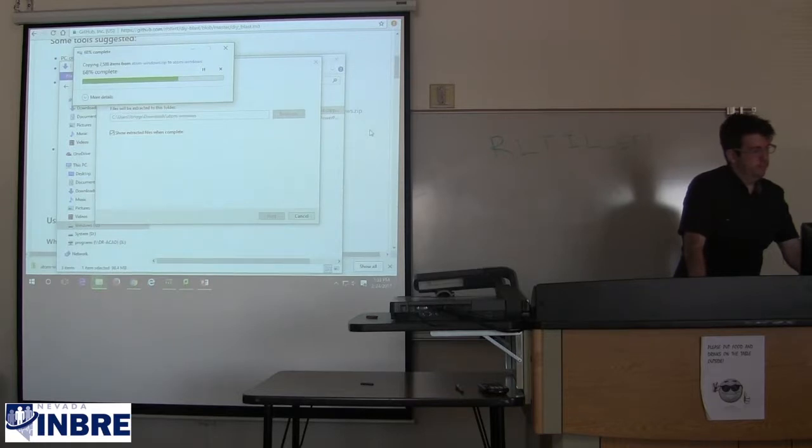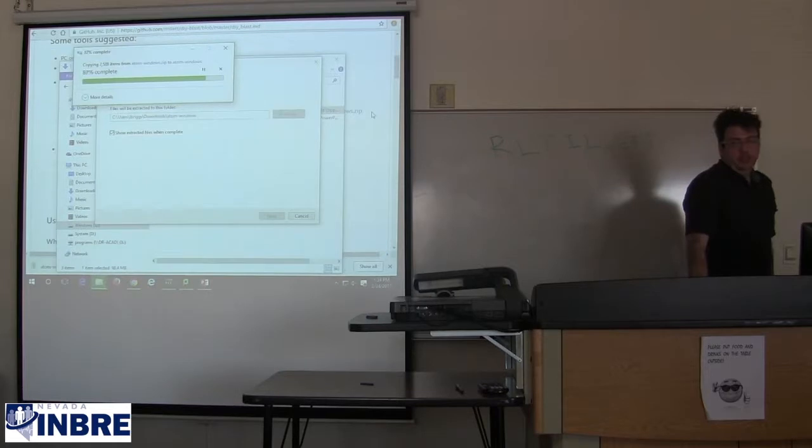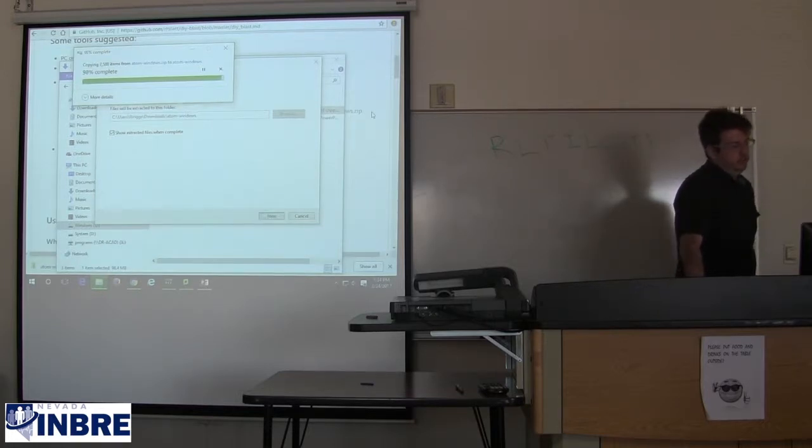And so neither of these are particularly required for doing a bioinformatic task. You could probably get away with using Notepad, but you run into issues career-wise if you rely on Notepad or Word documents for handling your sequences. You want a text editor that sort of does what it says and says what it'll do. And if you're doing cloning things where you might be using restriction enzymes, you're going to want something that allows you to map it out ahead of time, and that's what APE is primarily designed to do. But we're just going to be using it for its ability to work with coordinates in a sane fashion.